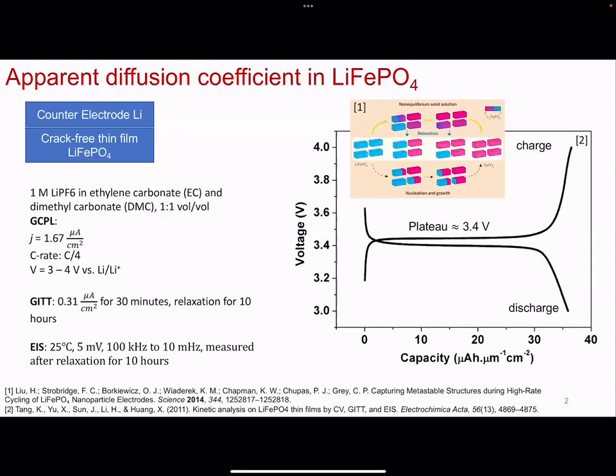And so what you can do is try to study, if I'm in a 2-phase region, what happens when I actually try to measure the diffusion coefficient, and what sort of signal will I see, and how do I know that I shouldn't be doing this? As in, you can misinterpret or overinterpret the data. So that's what we're going to talk about.